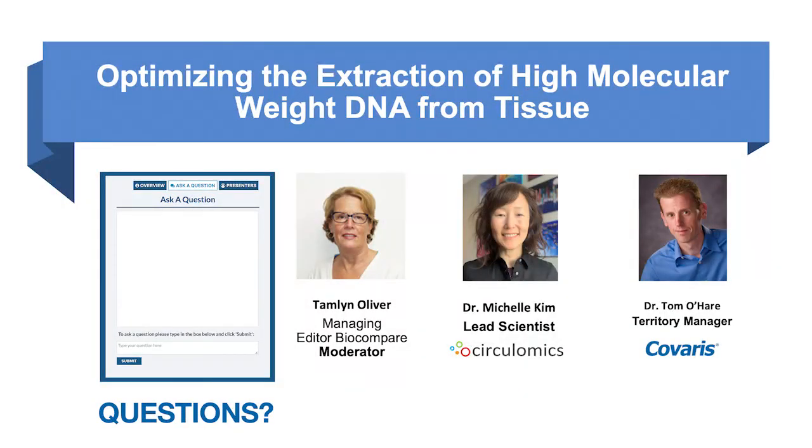Okay, thank you. Is the sample processing reproducible? Yes, especially with regard to the tissue disruption with the cryoPREP, it's very reproducible because the system itself is automated, and just the nature of that disruption is just high impact. With the tissue DNA extraction, as with any kit, it'll take a little practice, but it is quite reproducible. So with the same tissue type, we generally get the same amount of recovery and quality and size. Usually we find that the variations are probably due to the age of the actual sample or the portion of the tissue from which the sample was taken.